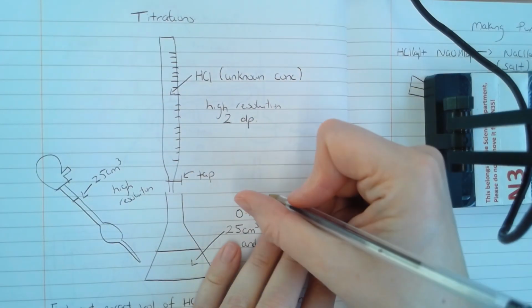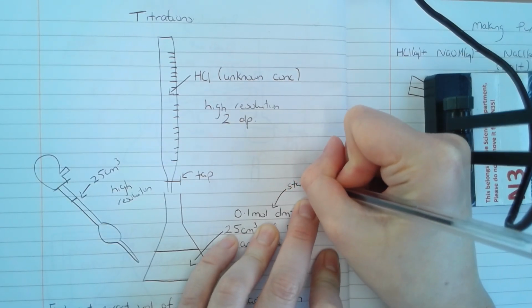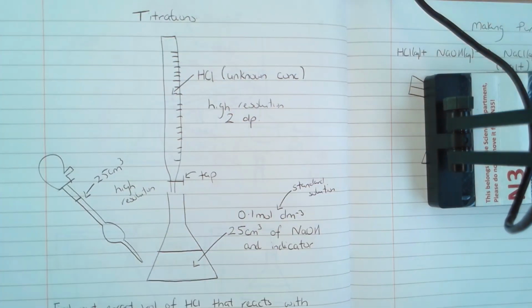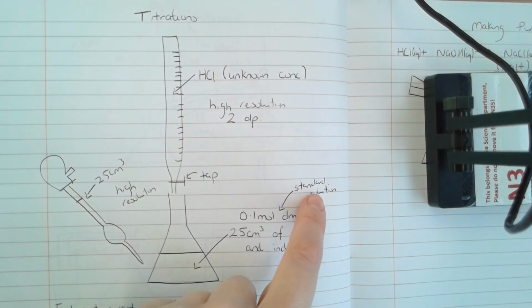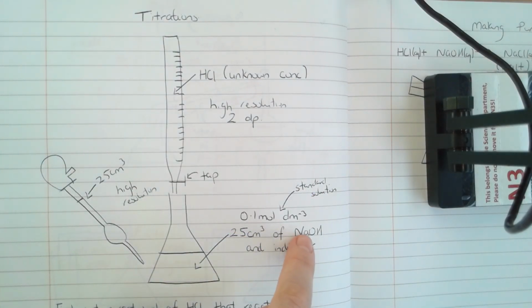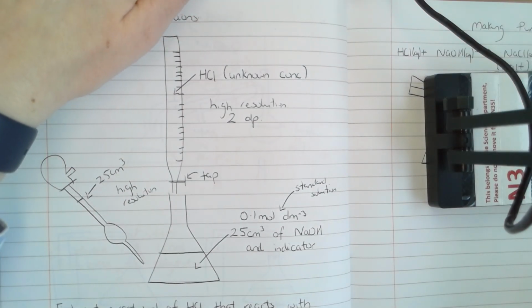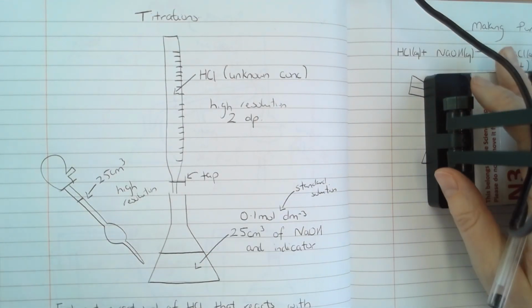And the one that you know is called your standard solution. So a standard solution is just a solution whose concentration is accurately known. And how do you know that it's accurate? How do you know for sure that sodium hydroxide has a concentration of 0.1 moles per decimeters cubed? Well, the answer is you have to make it yourself. You make that solution yourself, and you make it so accurately that you know it's going to be 0.1 moles per decimeters cubed.